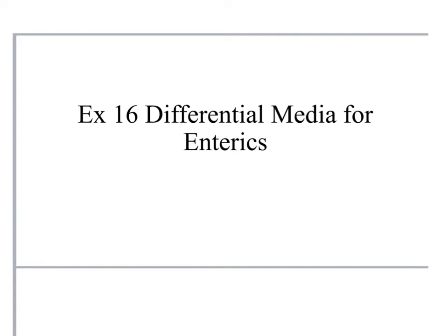Okay, exercise 16 is a big lab. There's lots to inoculate, so I've split it up into two videos here. The first video, I'm just going to talk about the organisms a little bit, as well as one of the media you're going to inoculate, and then the second video will be the other 5 tubes that you're going to inoculate. Okay, so we're in the home stretch.